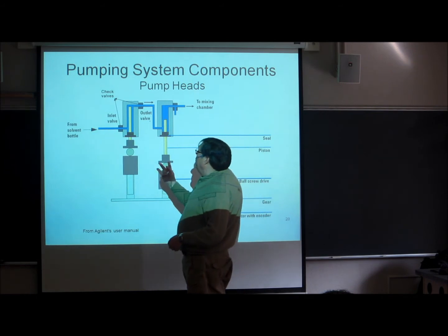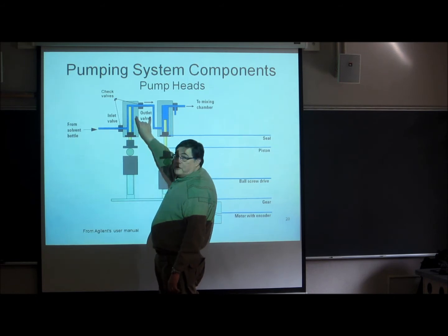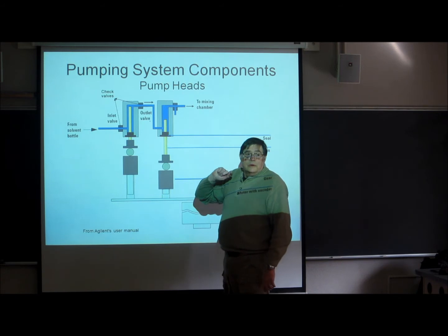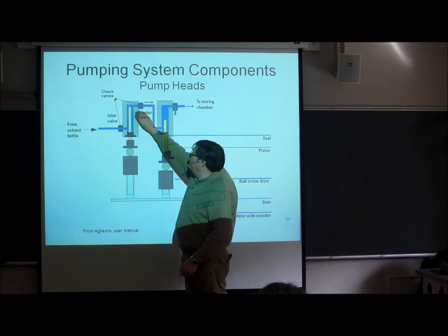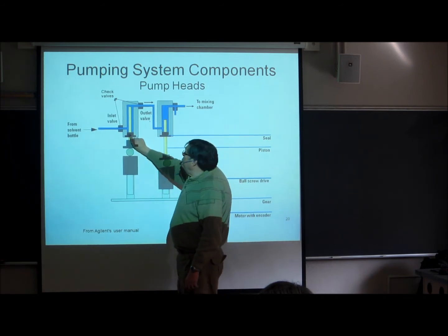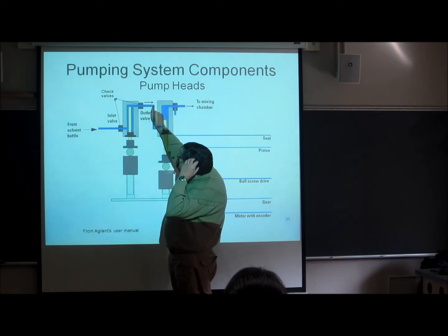Here we have a binary pump. Now here we've got the solvent coming in, and our pump has 2 different motors and 2 chambers. Why do you suppose you want to do this? This is like the pump that I showed you before, the piston. Let's say that you only have this one here, and this one is not here. When you push this in, you've got a check valve that keeps it from going through the solvent valve, so it only goes in one direction.